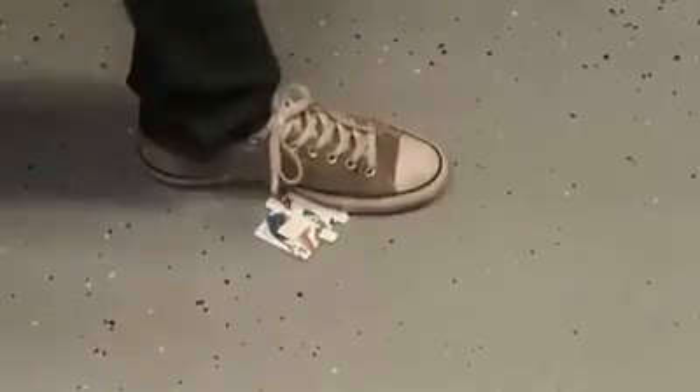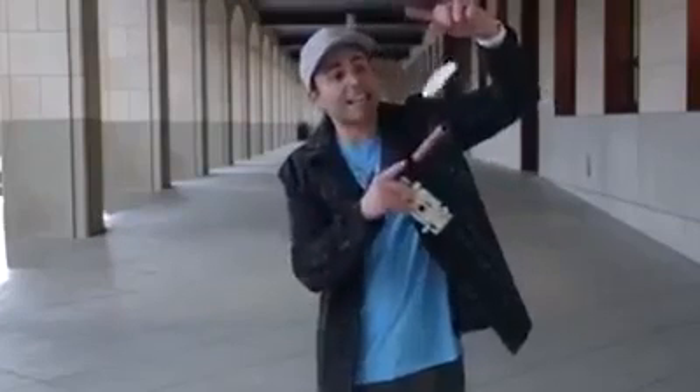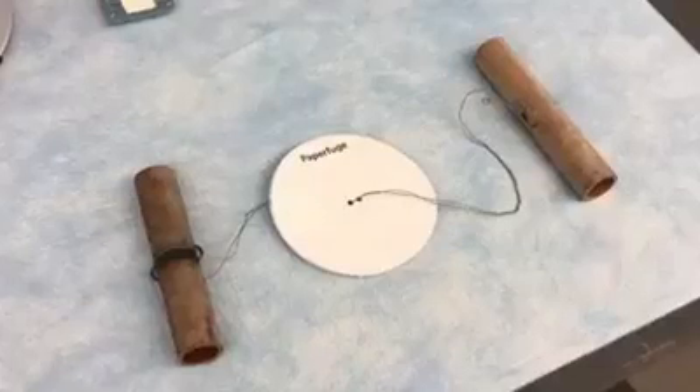Oh my gosh! So this might be... I'm holding in my hand a microscope that is waterproof, stomp-proof. I put it together in two minutes and it costs 50 cents to make. And in this hand, I have a blood centrifuge that spins 10 times faster than a $10,000 centrifuge and it costs 18 cents.